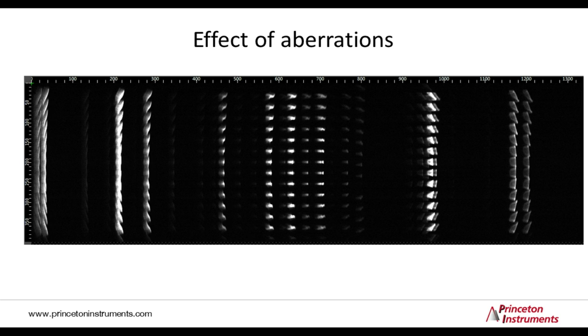This might be okay for single channel detector observations where you only collect signal in the center of the focal plane. But whenever you bin or look at a wider extent of the spectrum, the aberrations will lead to a decrease in spatial as well as spectral resolution of the spectrograph. So what can we do against that?